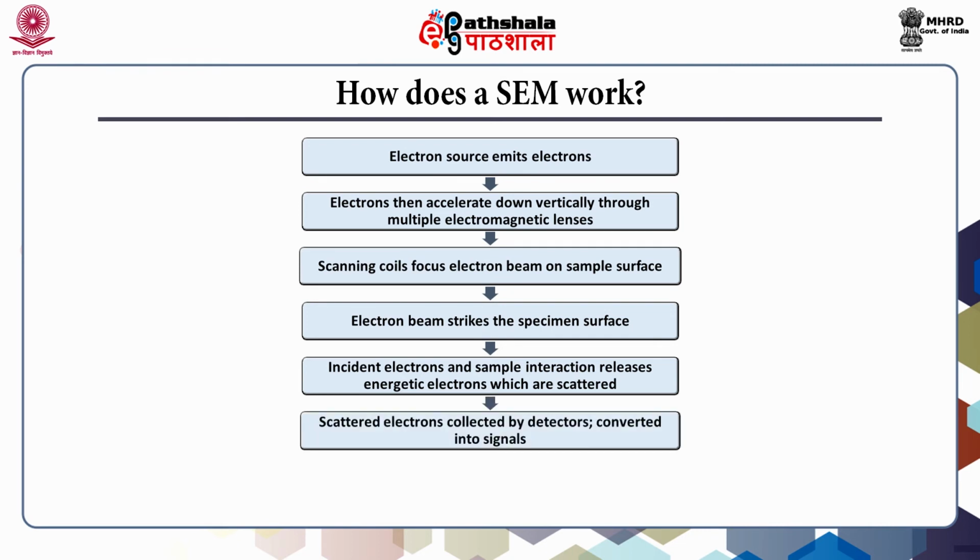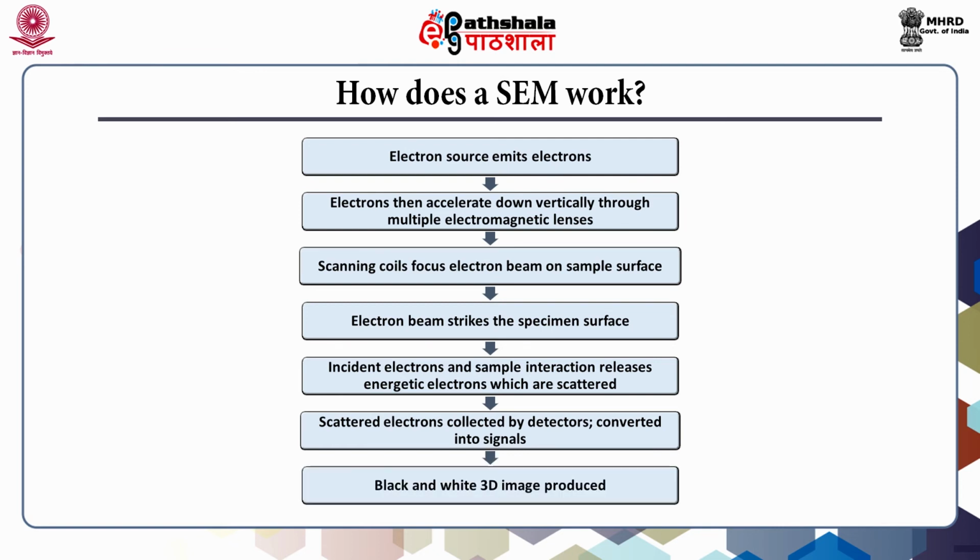The electrons are collected by detectors and converted into signal. The signals are sent to a screen to produce black and white three-dimensional image.